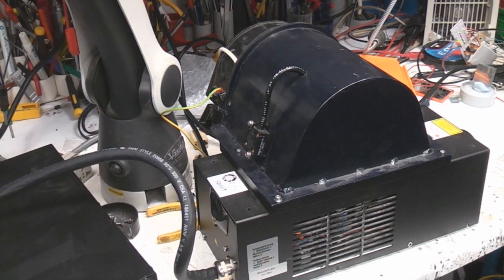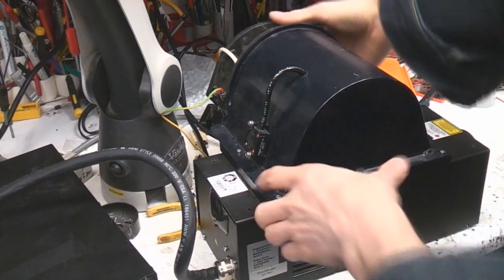And it's pretty bright. It goes up to about 100 milliwatts at full power. Just quickly go over this. There's tons of information on the net about argon lasers, so I'm not going to go into any huge detail. It looks like the fan for this was external, but again presumably to avoid vibration.